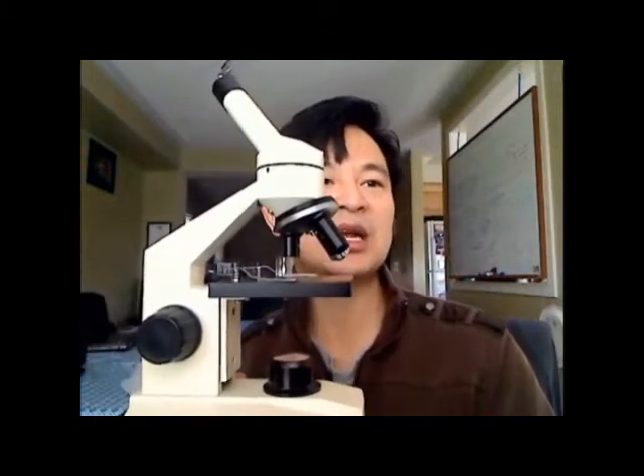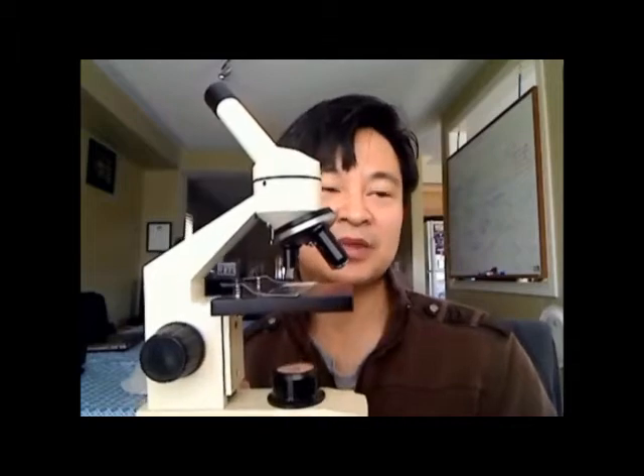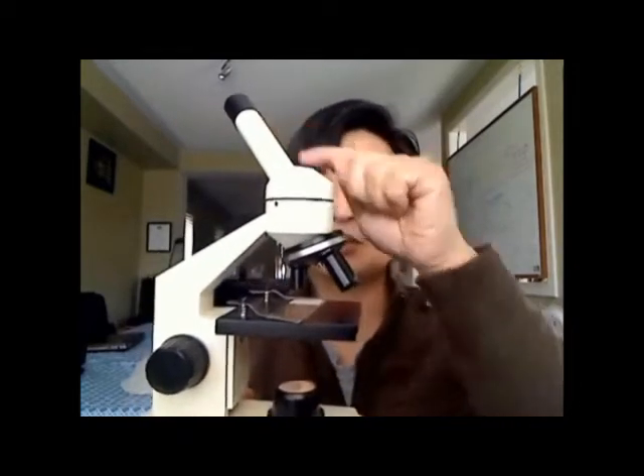There's even a blue filter you can put in there to give contrast to the image as you look under the microscope, and a nice adjustment knob as well. A good quality microscope runs around 80 to 90 bucks — you want a 400-times magnification. Of course, if you have the money you might want to go for the 1,000-times, but we'll stick with this type.